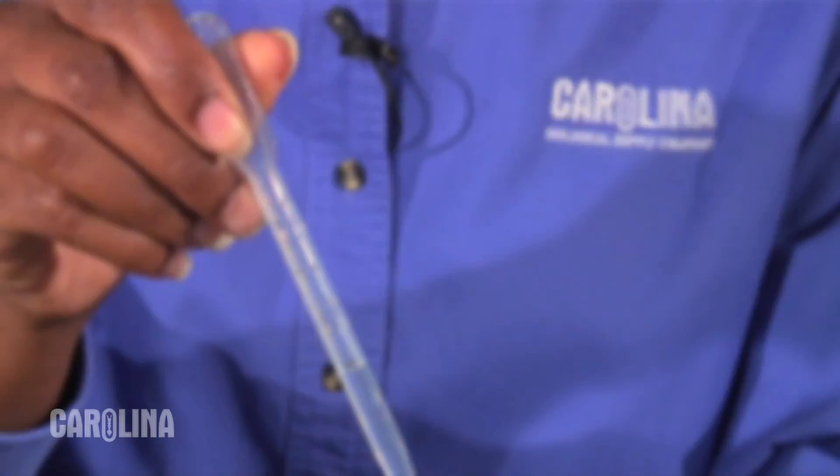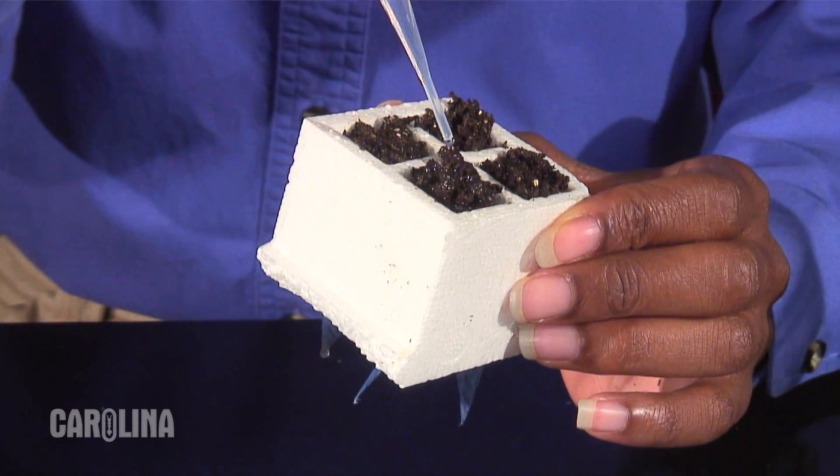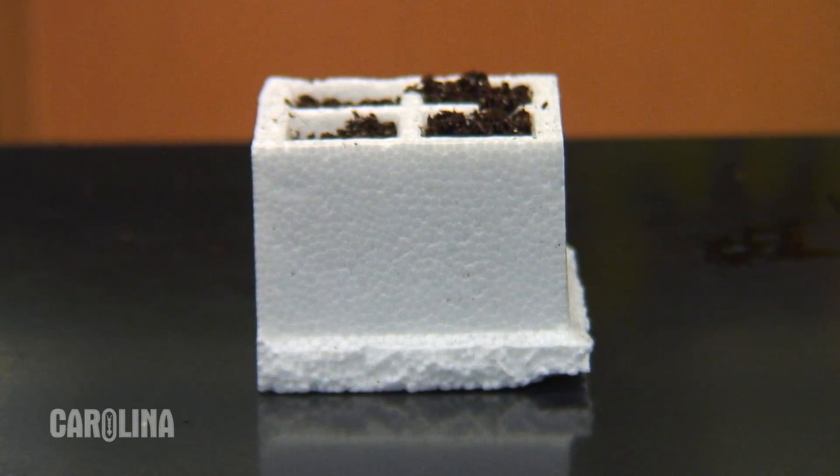Top off each quad with more soil. With a pipette, add water to the soil until it begins to drip from the bottom of each planting chamber. The quad is planted and ready to go onto the watering system.